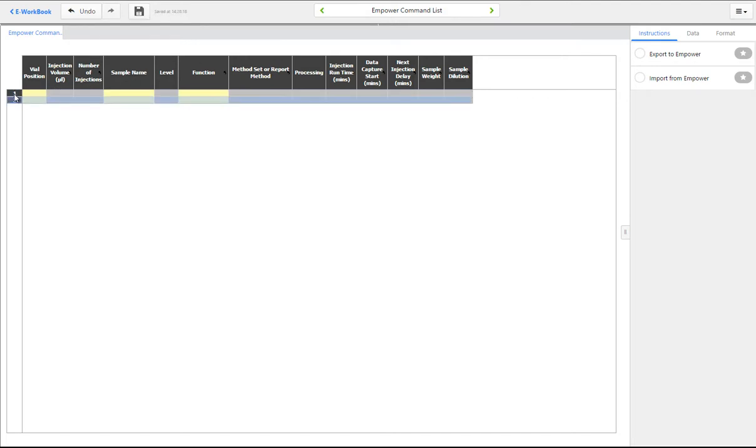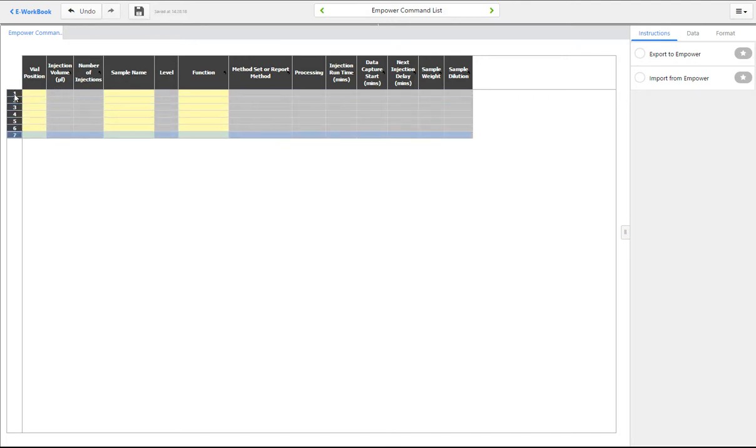A list of actions to be performed by mPower can be defined within the spreadsheet using your sample information.